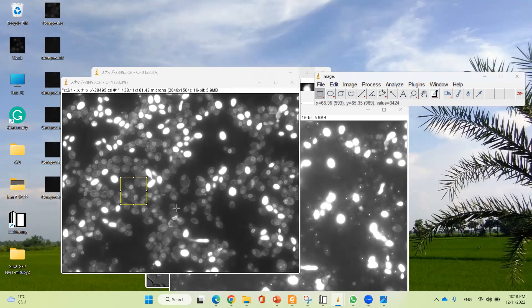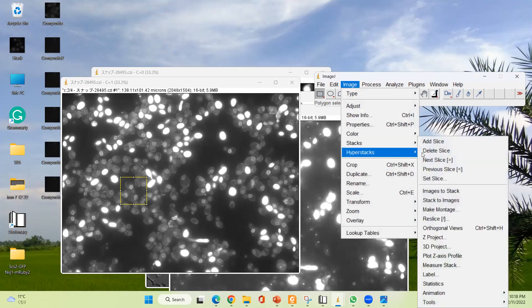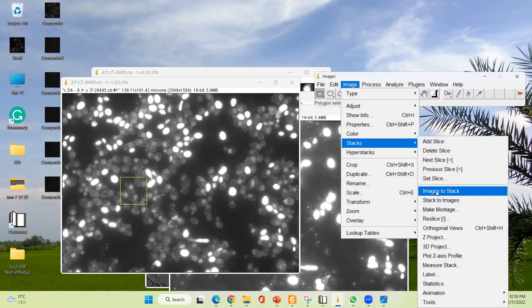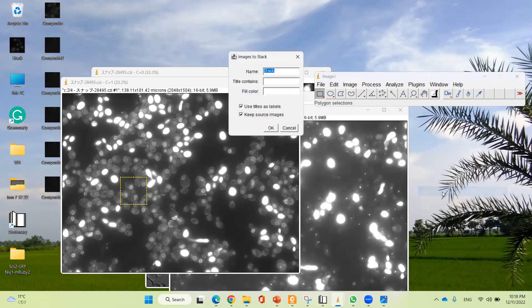After specifying the region, I'm going to apply Image Stack. If I crop this one individually, I have to crop each one separately, so I'm going to use Image Stack instead. Go to Image, select Stack, then select 'Images to Stack'. A window will appear and you need to ensure two tick marks are checked: 'Use titles as labels' and 'Keep source image'. I'm going to change the title, then click OK.